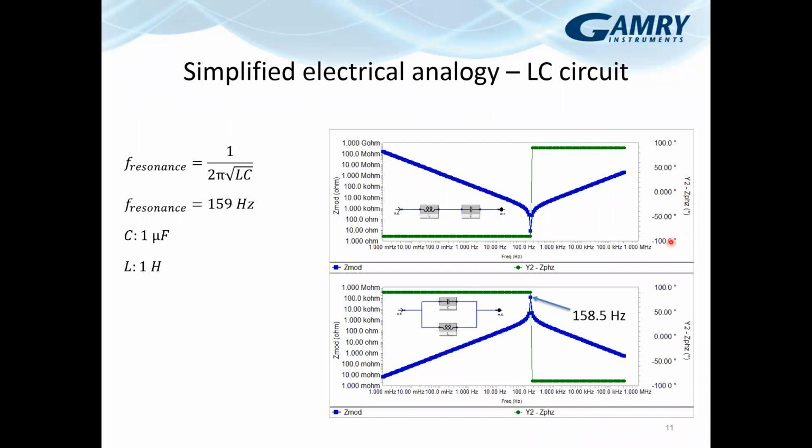And so what happens is that, for an LC circuit, typically you start at a high frequency, and as the frequency is scanned lower and lower, you'll hit a point where the impedance reaches a minimum, and this is your resonance. So in series, what you expect is a series LC circuit has a resonance where you have a minimum impedance.